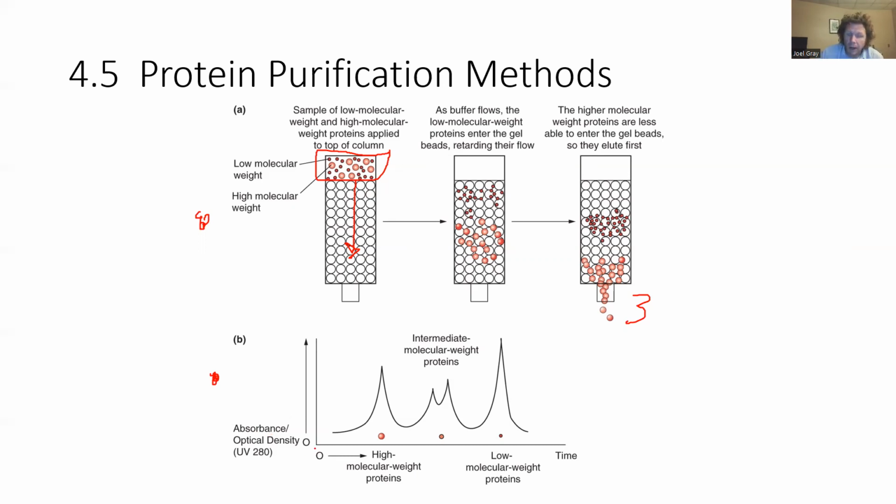Now, our x-axis, on the other hand, is showing the time progression. At our origin, we have 0 minutes all the way up to infinity minutes. So the very first minute where a sample was collected, the second minute, third minute, fourth minute, we're progressing from left to right. So what this shows is our high molecular weight proteins are going to elute earliest. Our mid-range and lower molecular weight proteins are going to elute as time goes on.